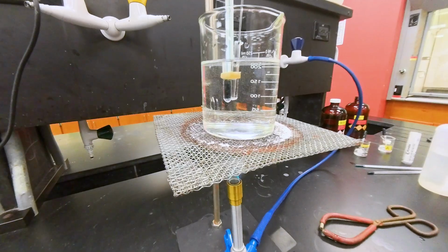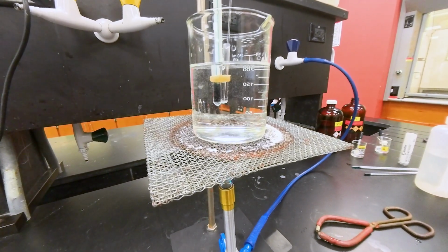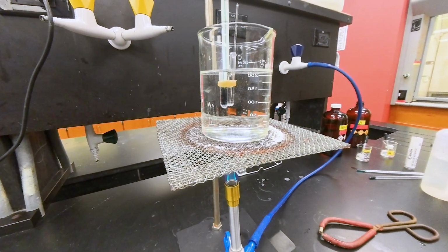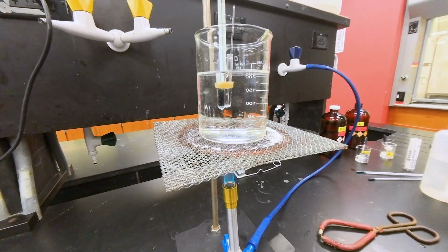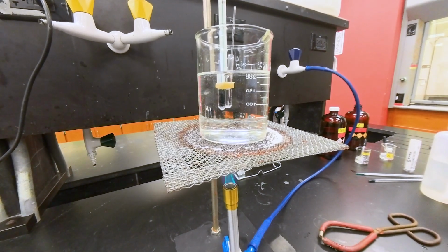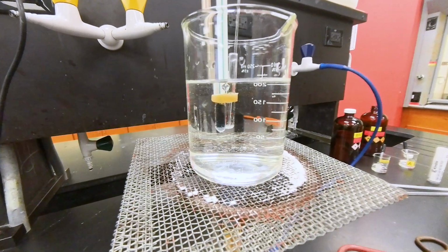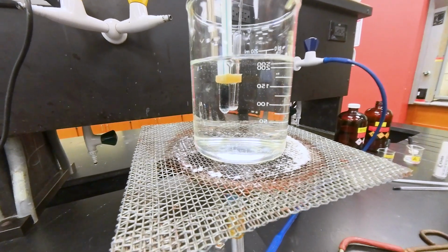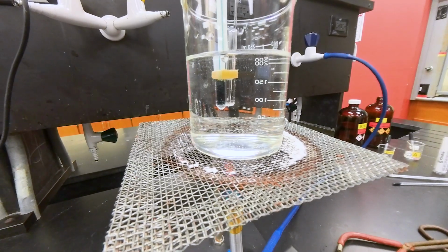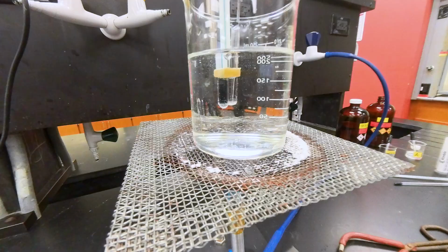We are waiting for that fast stream of bubbles. At that point, I will turn off the Bunsen burner and wait for the bubbles to stop coming out. We see the bubbles coming out now. That means it's close to the boiling point. When it comes out very fast, that's higher than the boiling point. Then we wait for it to cool down again to the boiling point.